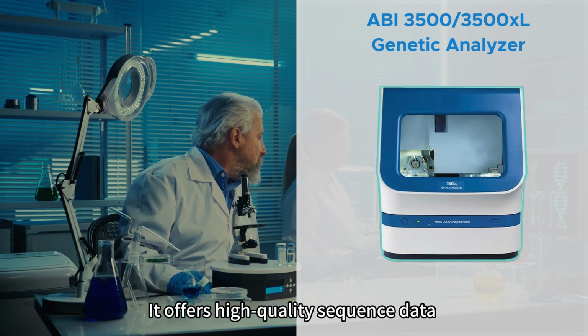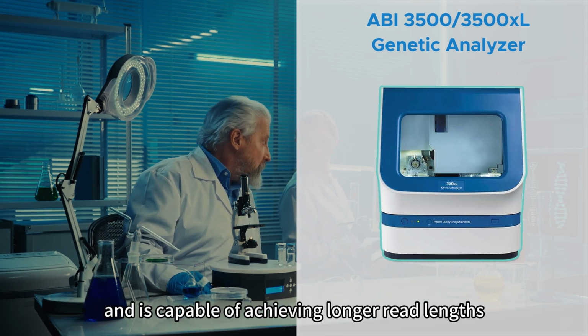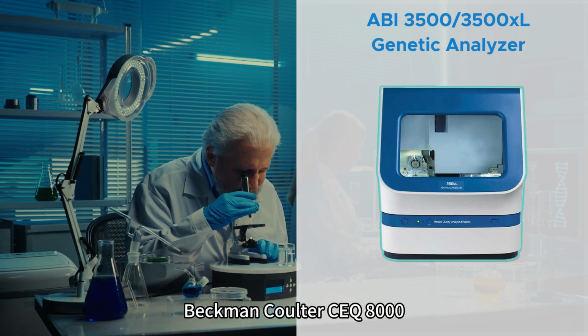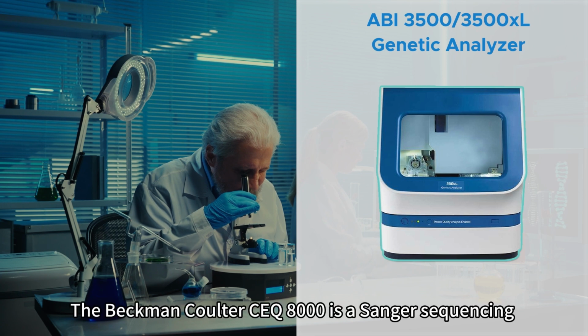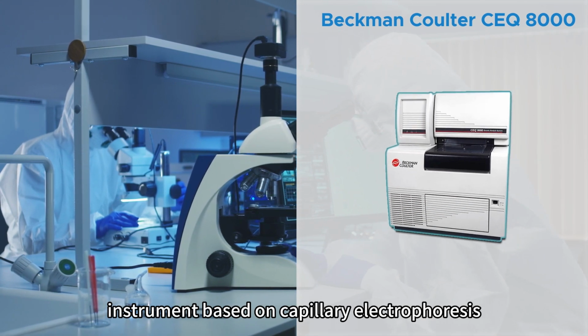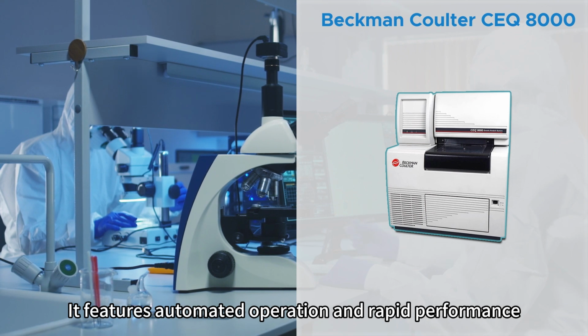It offers high-quality sequence data and is capable of achieving longer read lengths. Beckman Coulter CEQ 8000. The Beckman Coulter CEQ 8000 is a Sanger sequencing instrument based on capillary electrophoresis. It features automated operation and rapid performance.